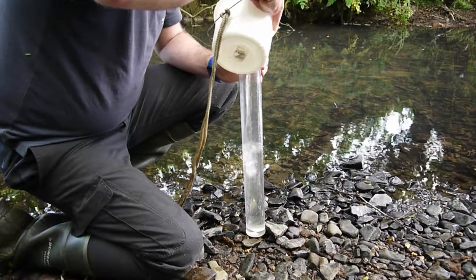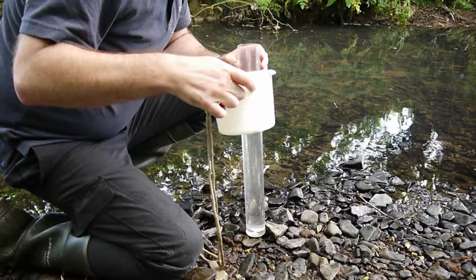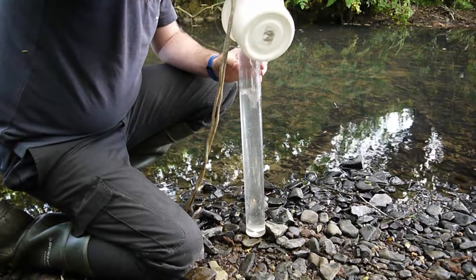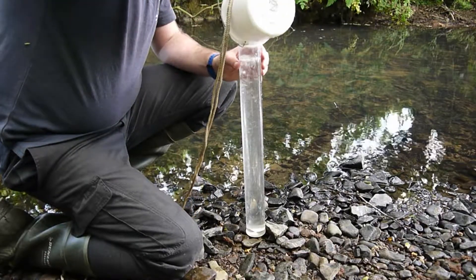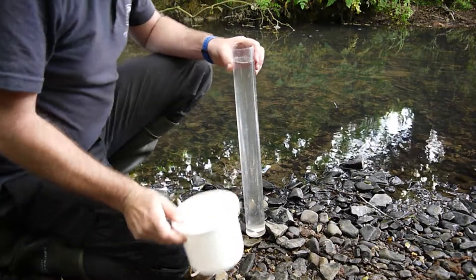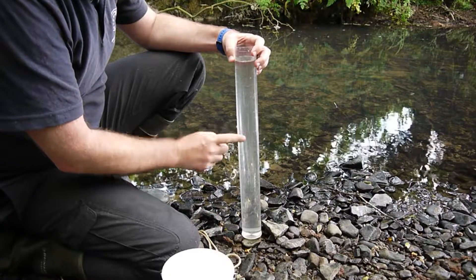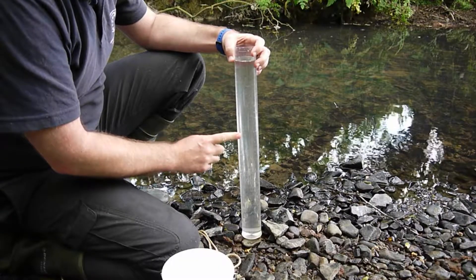It's worth stopping every once in a while to check that you can still clearly see the disc. You'll soon get a feel for what a turbid sample looks like. If you get to the top of the tube and you can still see the disc, then you record it as less than 12. If you're somewhere in between, you can record the number nearest to where the water level is.